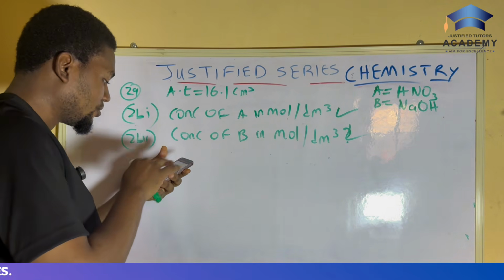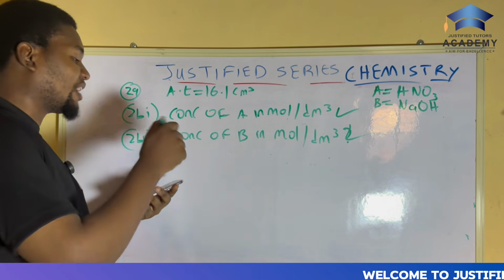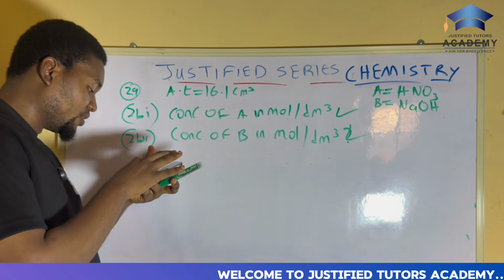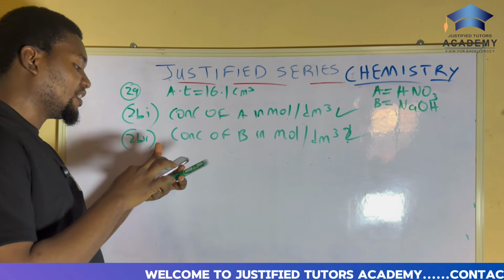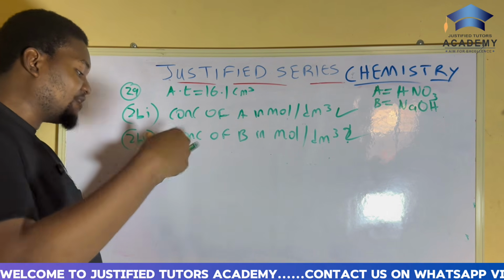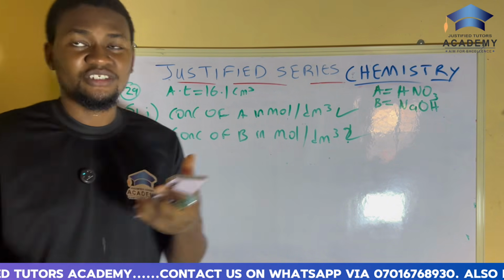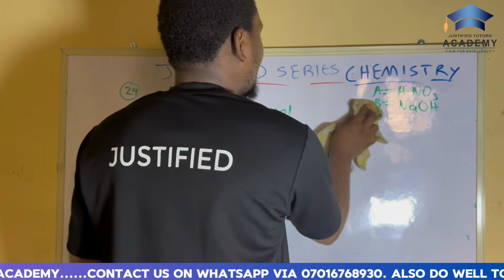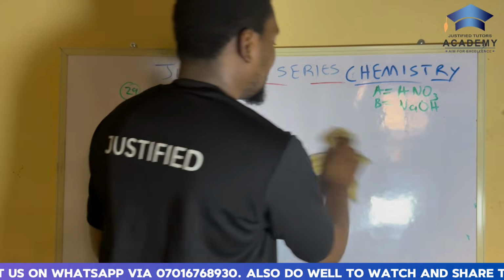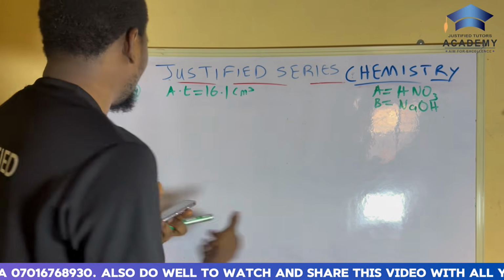I don't skip any part too. That one is really simple. So, this particular part on titration, you usually have 3 calculations and then 1 theory, or 4 calculations. The previous one, we had a definition there. They said, give reasons why the starch indicator was not added. That was the question there. So I skipped it because it's just the normal stuff. You should know it by now. You're a chemistry student. So just go and read on it. You have the material, just read on it and learn it. Although that one will not come to exam. Please be careful. That one will not come to exam. Just learn it, in case they ask you.